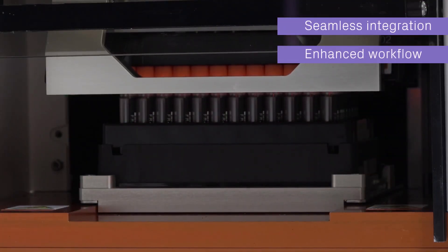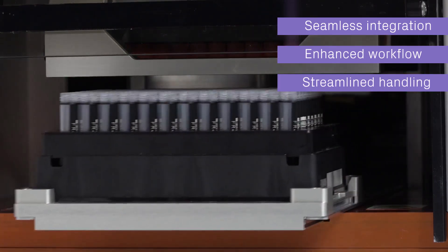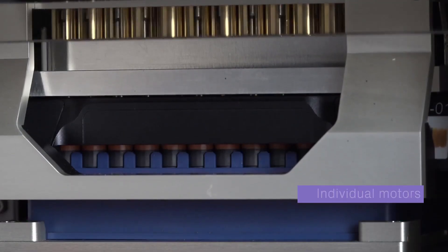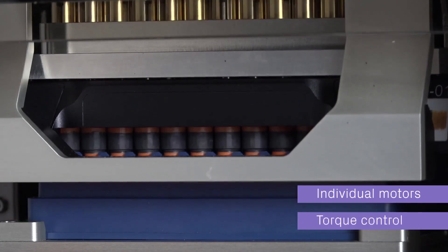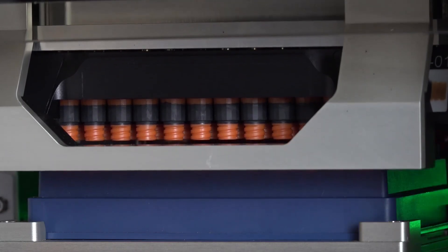IntelliXcap is designed to fit seamlessly into your workspace, enhancing your automated workflow and streamlining your handling processes. Individual motors ensure torque control for added long-term resilience in high throughput labs and secure consistent sealing.